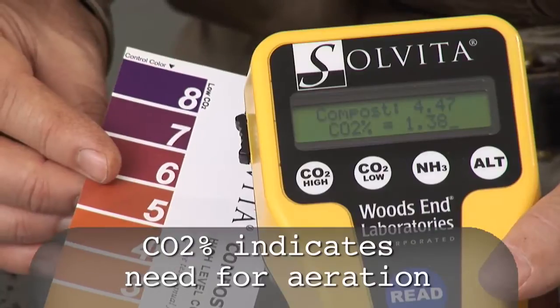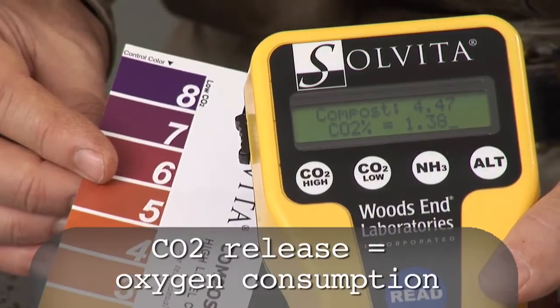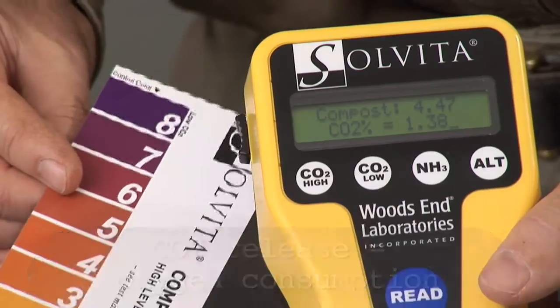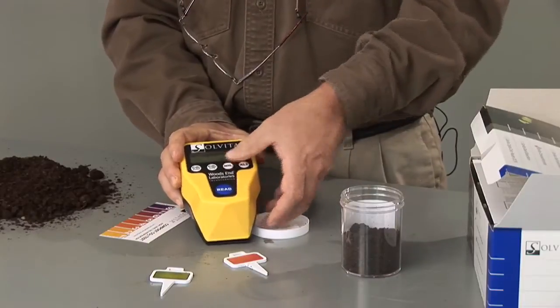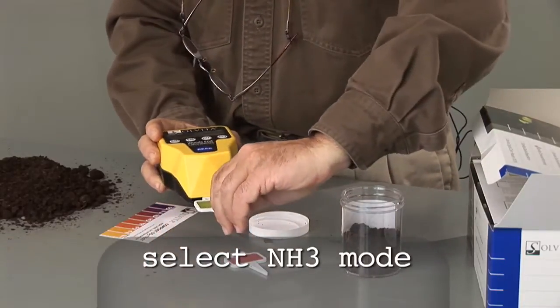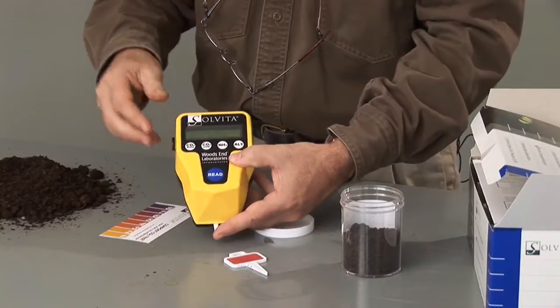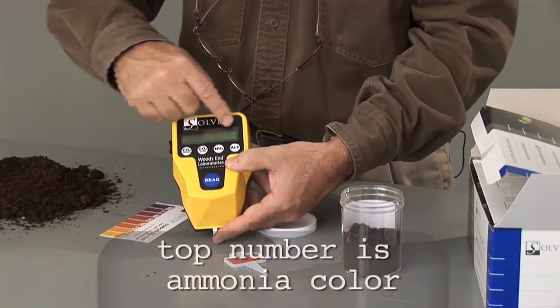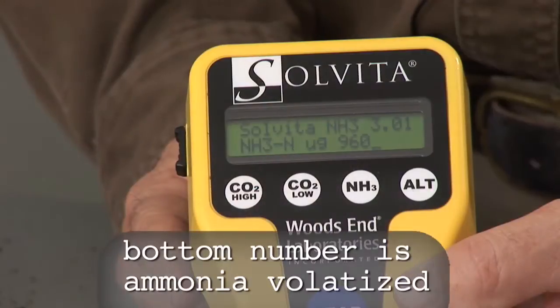That's a very interesting number because it tells you how much oxygen has been replaced with carbon dioxide during the four-hour test. Now let's read the ammonia test. Press the ammonia test button, insert the ammonia probe into the reader, and press the read button. This will show the Sylvita ammonia color number on the top of the DCR, and the second line shows the amount of nitrogen that has been volatilized during the test.